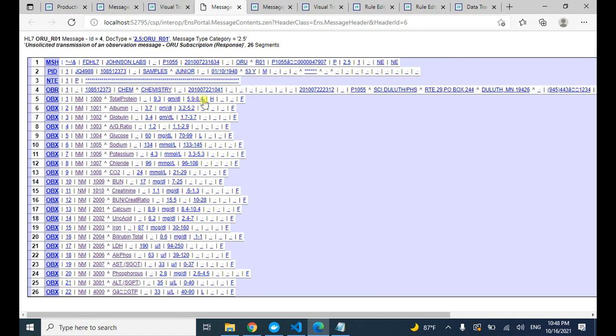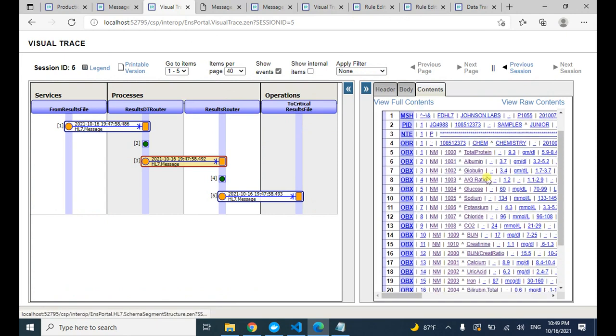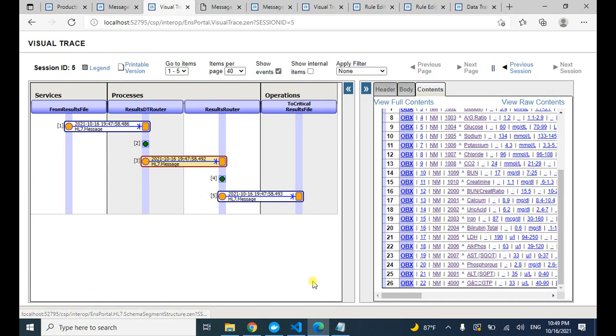As you noticed here, it set the flag to high because this result is high, and the next one, this 1004, it set to low because it's low, and the last one, this 4000, which we added manually, is also set to low. And it sent the file to the critical result file because some of the results are abnormal.